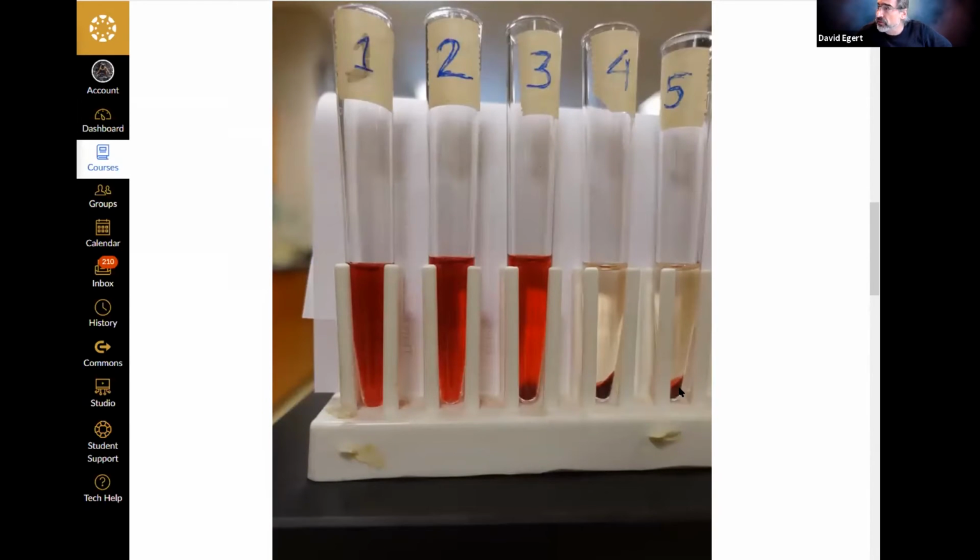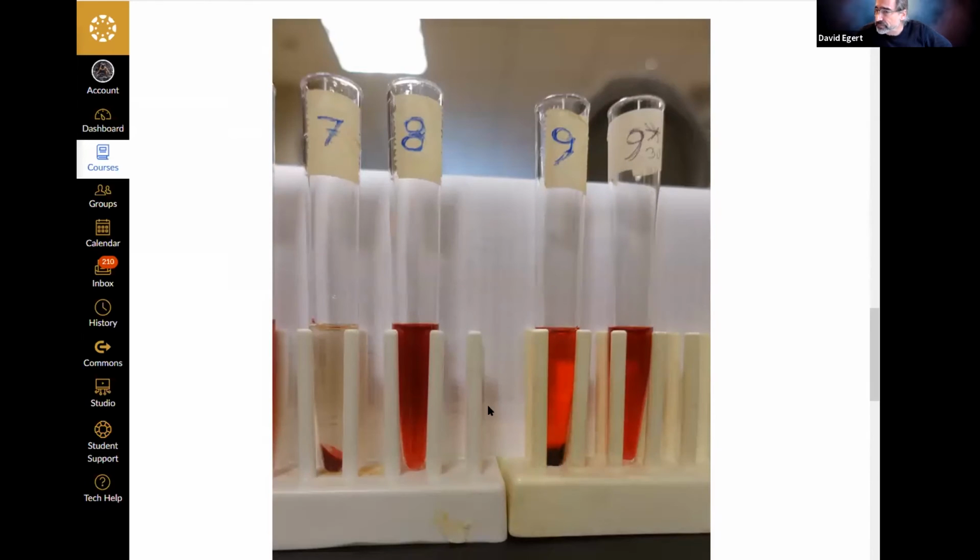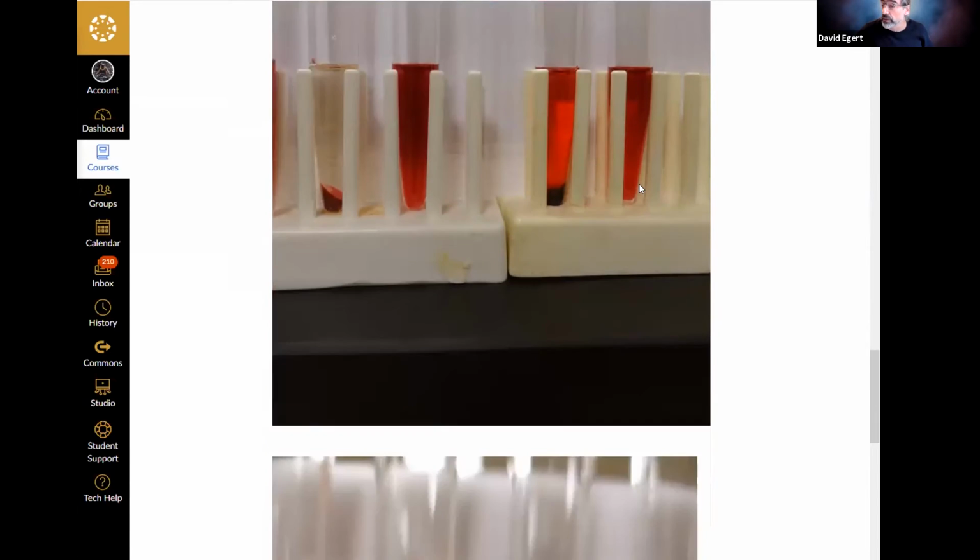However, the pellet's a little smaller in 5. 7, no hemolysis. 8, here again, the 9 and 9 star, you can see a big difference. Both have some hemolysis, but in the one that was only in for 5 minutes, a lot of the cells survived. Whereas the one that was in for over 30 minutes, they all exploded.